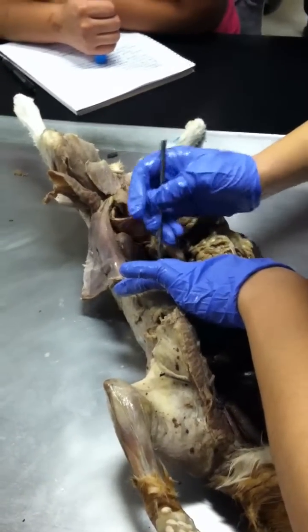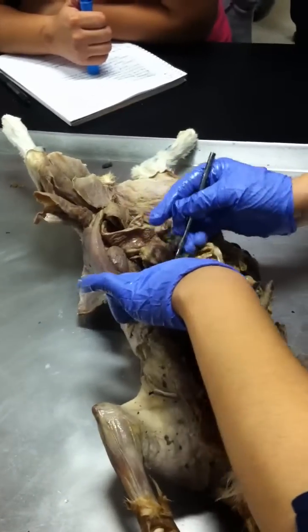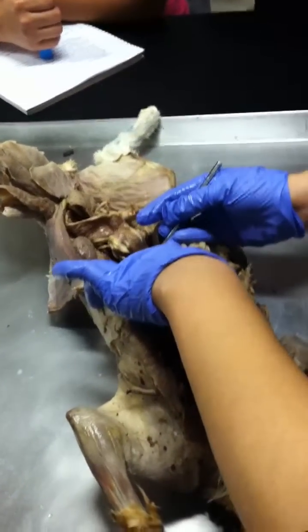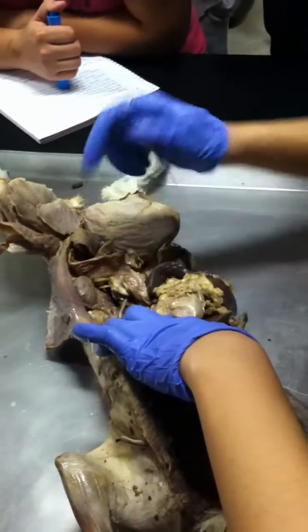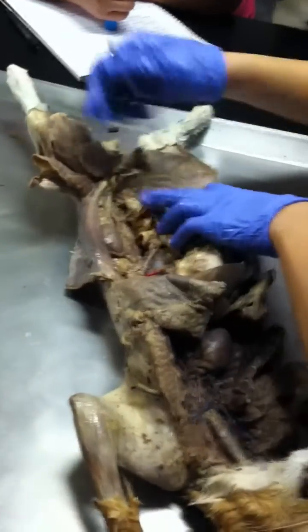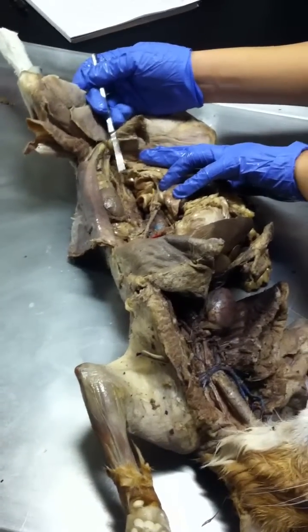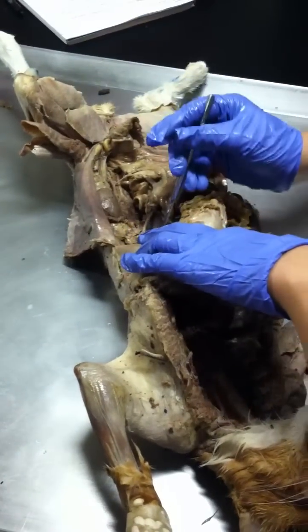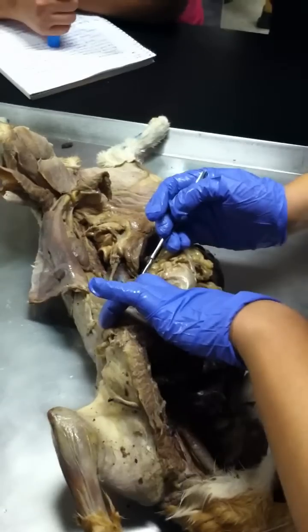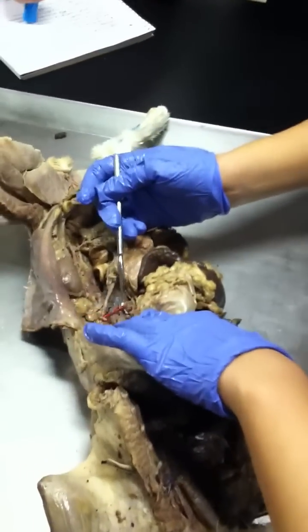I think they're right here. Okay, so do you guys see this blood vessel here? There's one here, and there's one here, and the one all the way down here. All right, this last one is the what? Inferior mesenteric artery. Good. And then the very first one is the celiac artery, and then this one right here is the superior mesenteric artery.